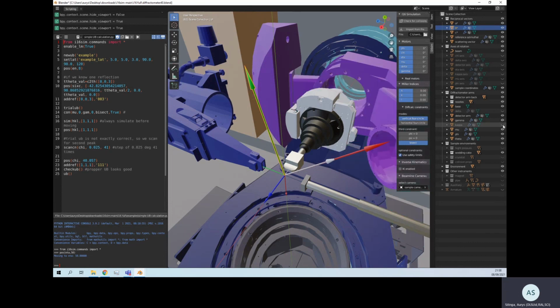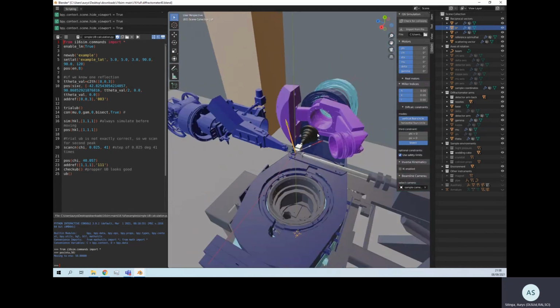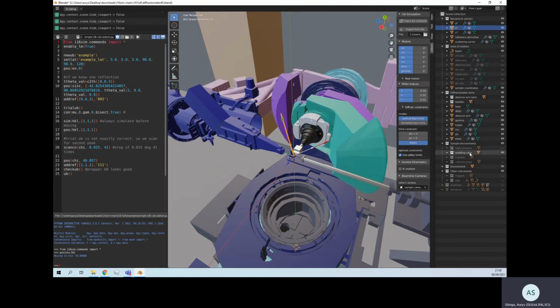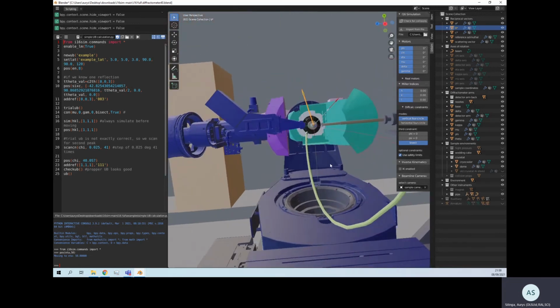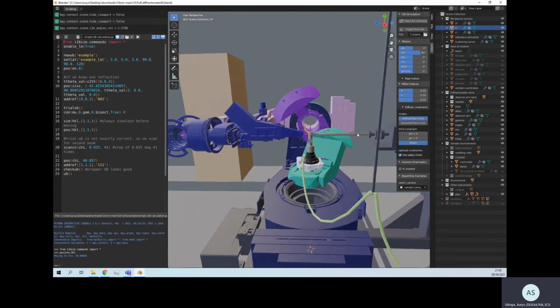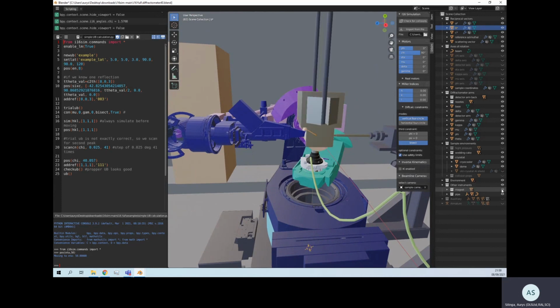and hide diffractometer arms. When we check for collisions, it only checks meshes which are visible, so hiding them makes the simulation run faster. And we can also change between sample environments. For example, put a dome on the cryostat. And if we want to be more adventurous, we can attach the pipe to it, which would normally supply liquid nitrogen. And if, for example, we knew that our experiment needs a few Tesla of magnetic field, we can also add the big magnet.